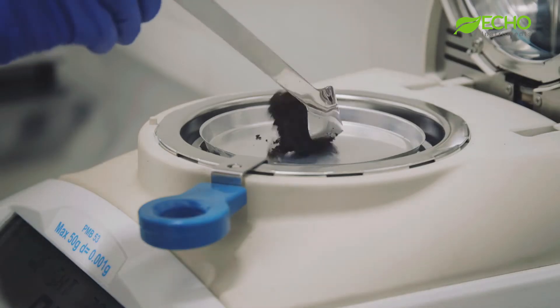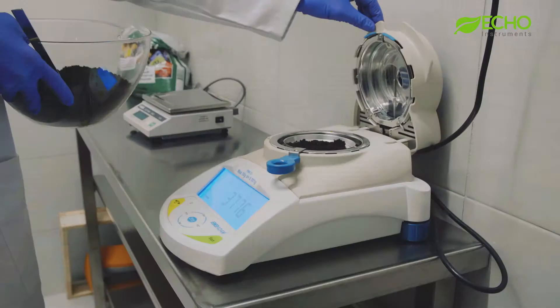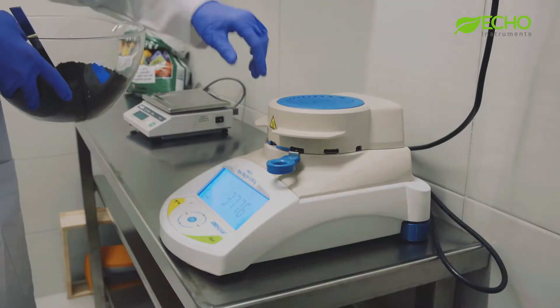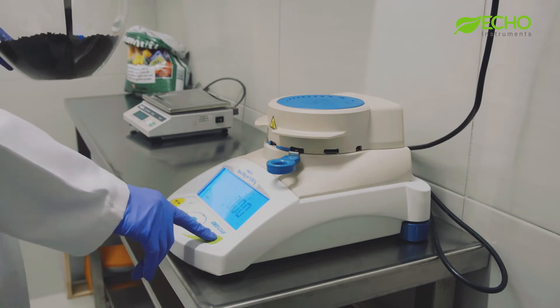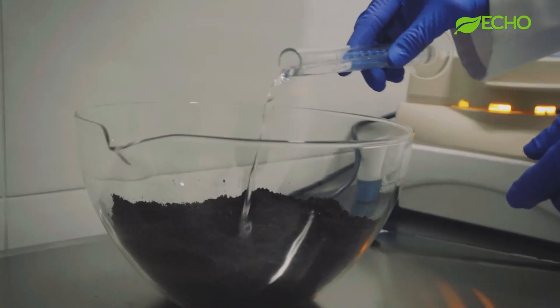For quality measurements, it is crucial to have the right compost as the basic medium for measurements. Measuring humidity is necessary to calculate the optimal addition of water in the compost.